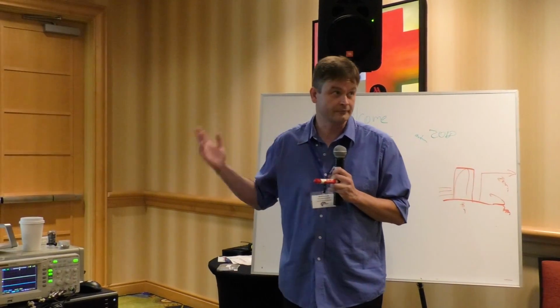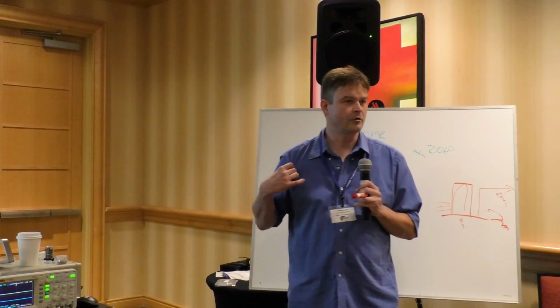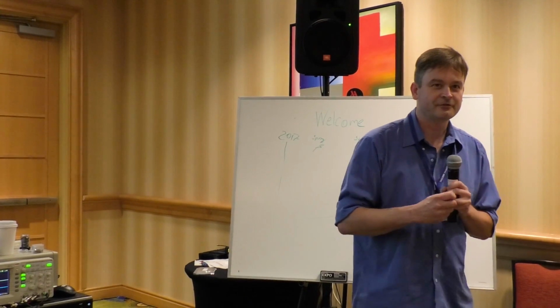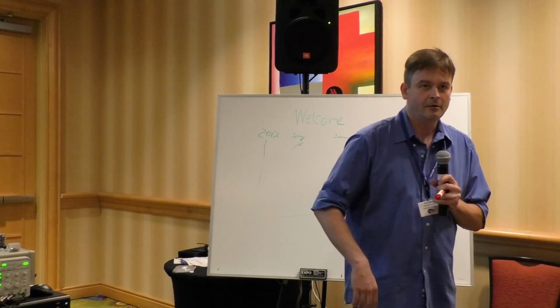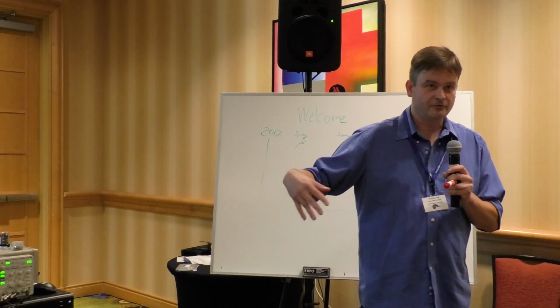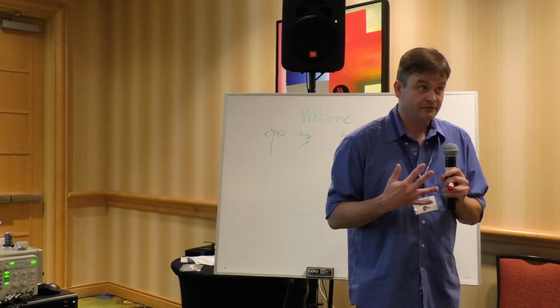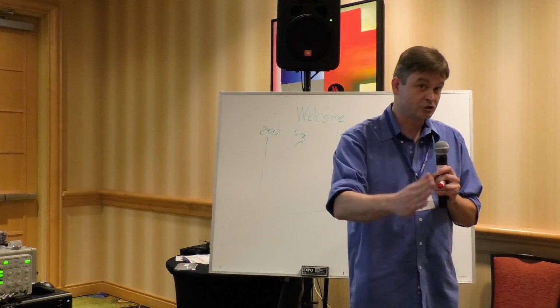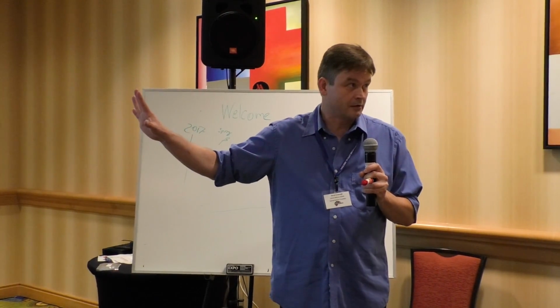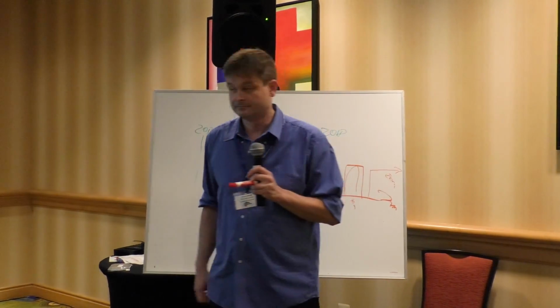They're all published, they're on the wiki. And we've had that not that long ago, I think Paul Kaufman, are you here? Yeah. We had this discussion with Joan and you about what is this measurement? And is this a D1 or a D2 or is this an A1? Where does this go? And I acknowledge this right away. There is not an absolutely sharp line. These are guidelines to see where you are and then make your best guess as a good scientist of what would be the right thing to do.